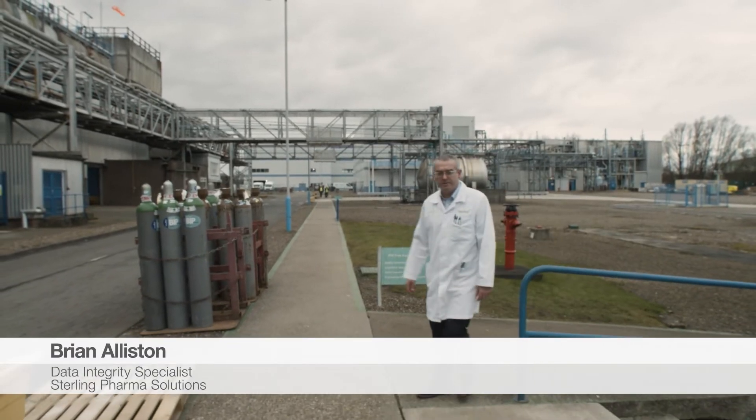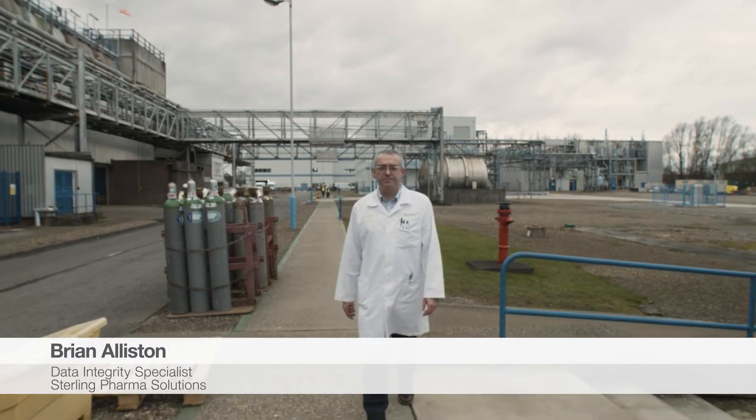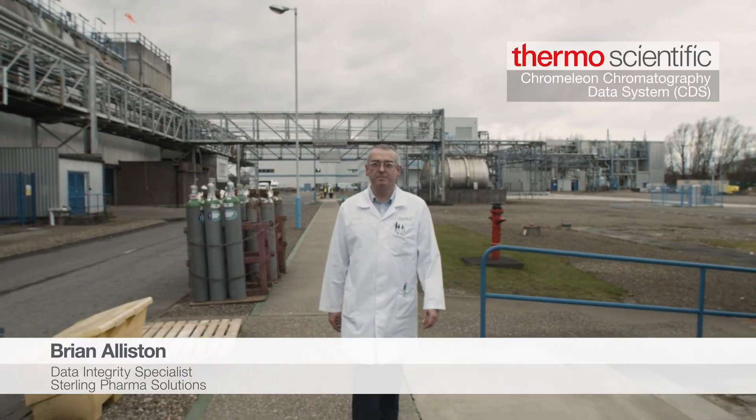My name is Brian Alliston and I'm the Data Integrity Specialist. I look after Chromeleon CDS as an administrator.